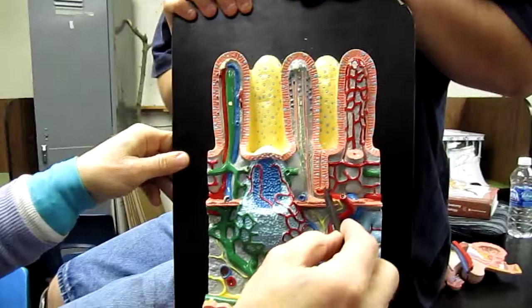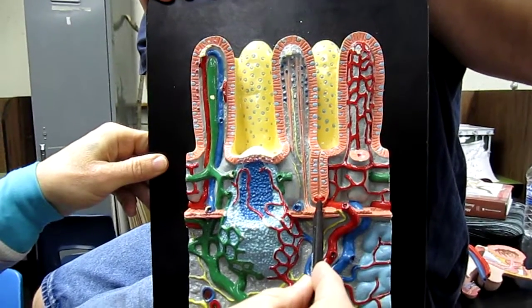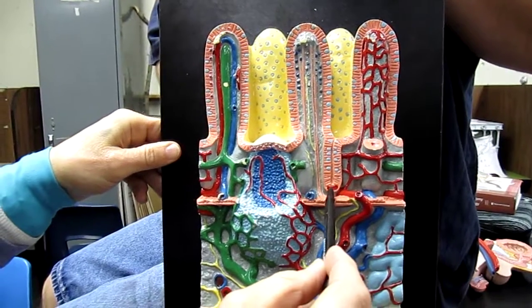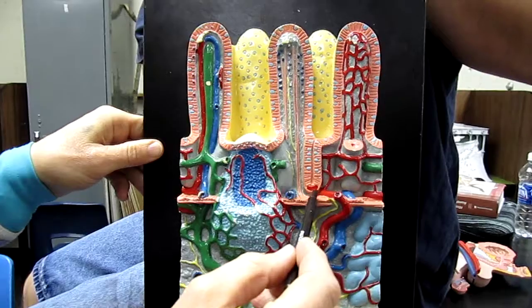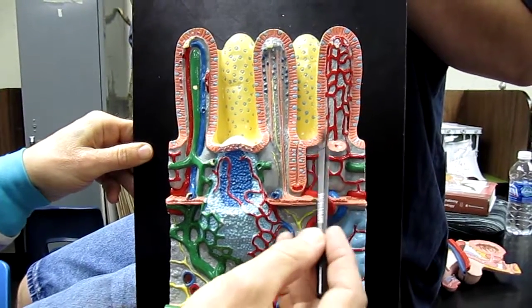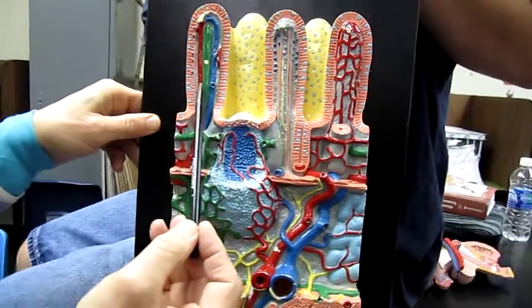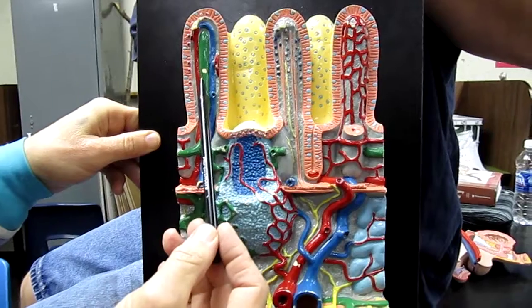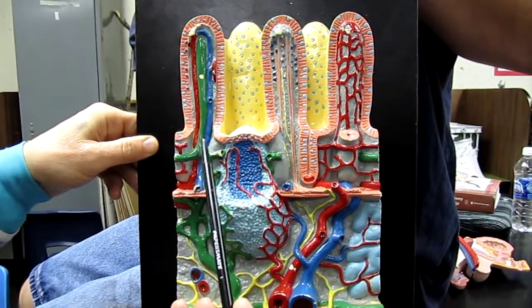Way down here we have various kinds of digestive enzymes and hormonal releases, hormones such as somatostatin, and there's going to be some local serotonin, stuff like that. All of these little goblet cells here are going to release mucus. Here inside the villus are going to be capillaries as well as lacteals, so the end vessels of those.